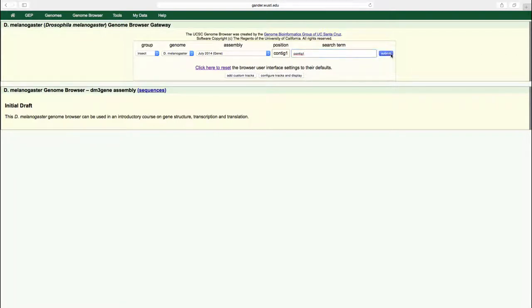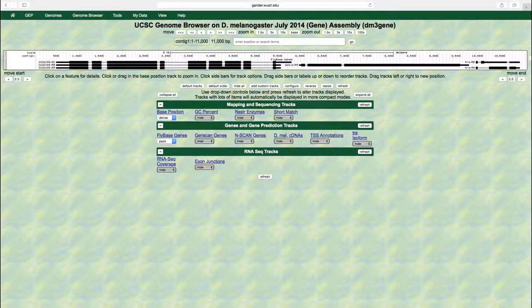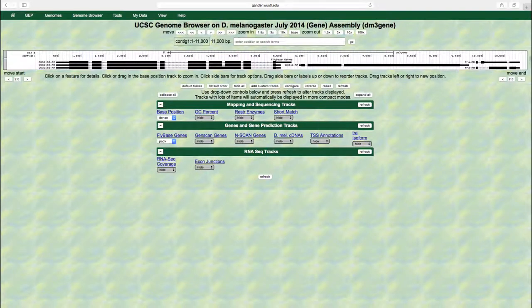The default view shows the entire length of contig1, which consists of 11,000 nucleotides. The FlyBase genes track shows the D. melanogaster genes on the pack display mode. With this view, we can see the gene and isoform names to the left of each feature.